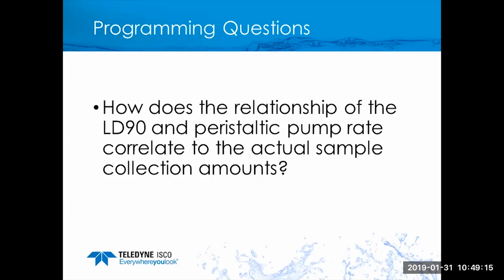That kind of ties back to the question that was just asked about deviations. So for example, one of the things that will impact that consistency or that accuracy would be fatigued pump tubing. Pump tube that's wearing out, tube that's beginning to develop fractures in the wall, or be severely abraded. It's gotten to the point to where it's deformed and it's more oval rather than round in shape, so it's not springing back to shape after the rollers pinch it, which is where the vacuum is developed from. When you see that, change the pump tube. Never run the pump tube to the point of failure.